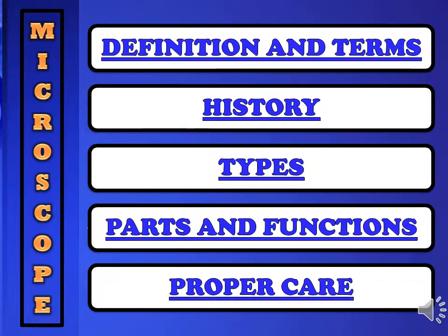Now, you already know about the microscopes. Its definition and terms. Its history. Its types. Its parts and functions. And its proper care. Any questions regarding microscope? None so far, okay.